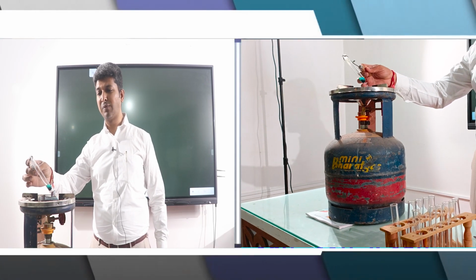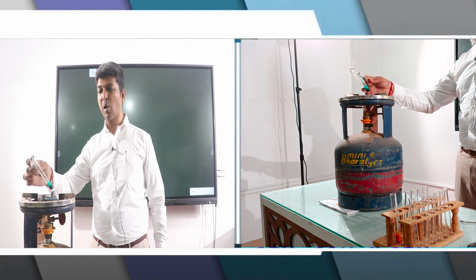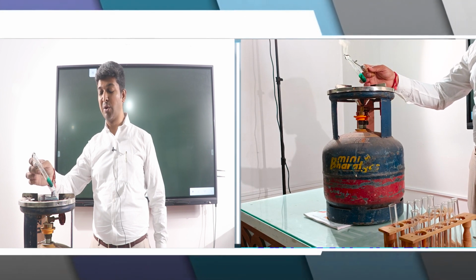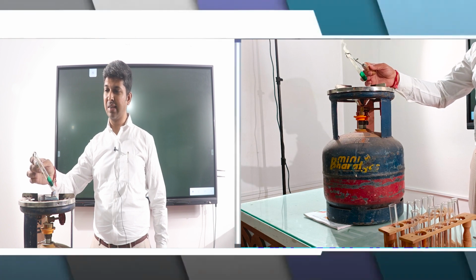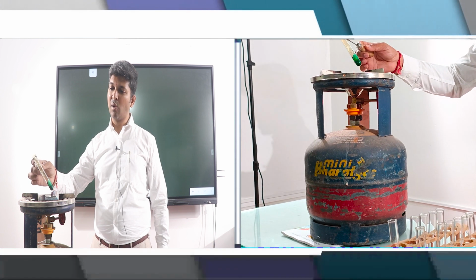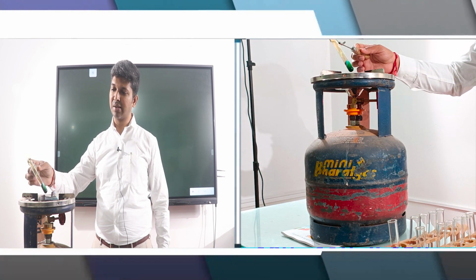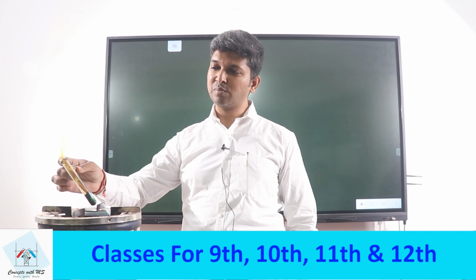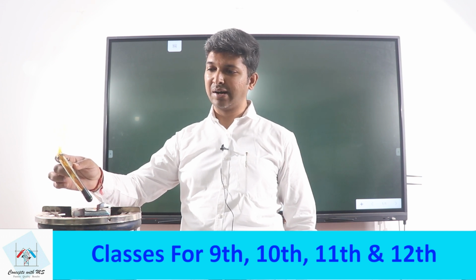Slowly it will decompose to form black colored copper oxide, and you will also see reddish brown color fumes which are coming out from this. Right now the fumes are transparent, but slowly you will see that reddish brown color NO2 gas will start coming out. Can you see those reddish brown fumes? Yes, pure reddish brown fumes of NO2 are being emitted over here.